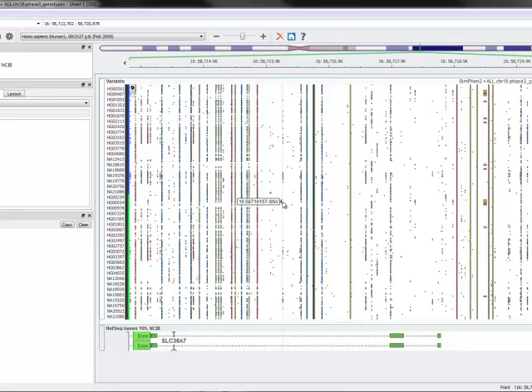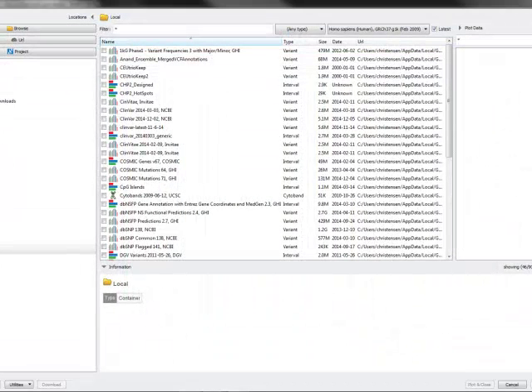Also, we may want to focus only on variants that we expect may have some influence on the gene product. And so we'll need to decide how to approach that. SVS allows us to interact with a number of different annotation sources for looking up parameters of individual variants and applying filters to keep or remove certain types of variants.